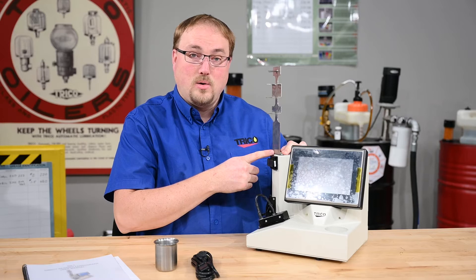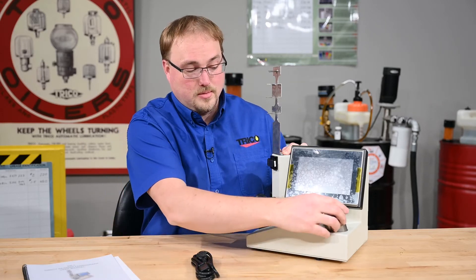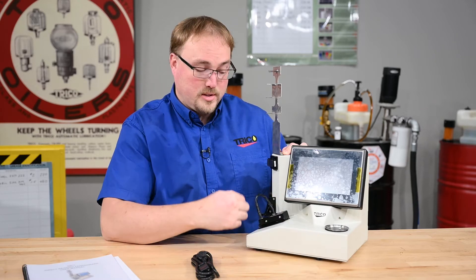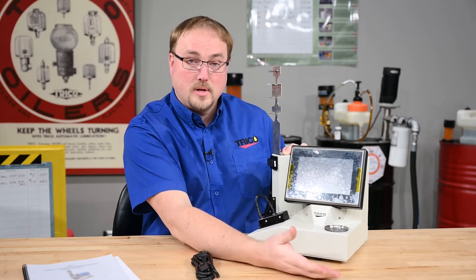Now we attach the vial holder to the unit. Then we take the waste beaker and place it in the receptacle. That'll hold the waste oil — when the unit has completed running, the waste oil goes there, and after it's full, you can empty it out.